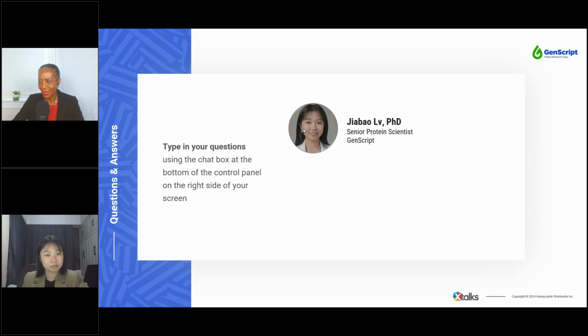Perfect. Thank you. Okay, this looks like it's our last question here. This audience member is asking, in addition to Prime editors, do you also offer other gene editing tools such as Cas9, dCas9 base editors and cytosine base editors? And if so, could you provide information on the specific types of versions that are available?